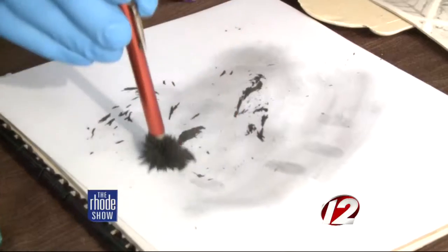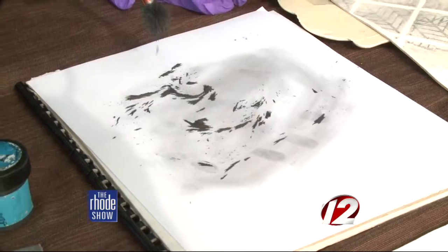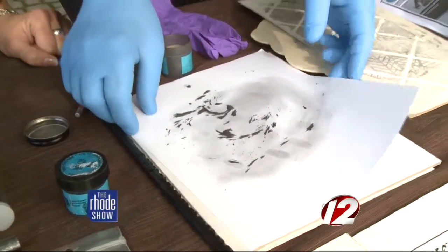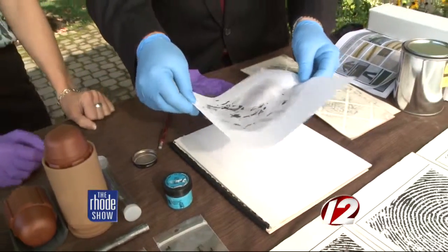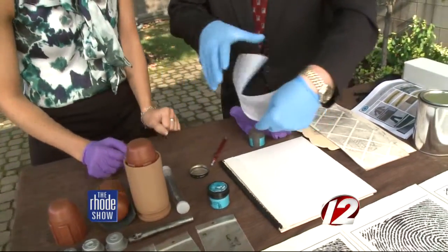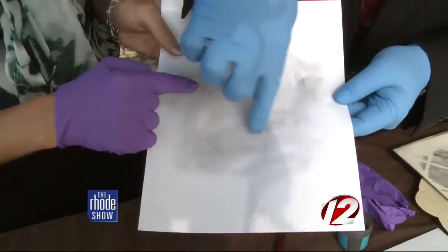So this will be used on like a banknote, anything that's fairly fresh on paper. Of course, there's a lot of other procedures that can be used for developing fingerprints, including superglue fuming and dye staining. But this works really quickly on paper — here's your four fingers, part of your palm is here.